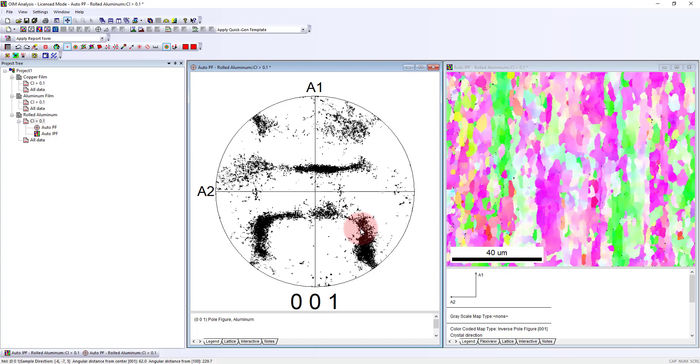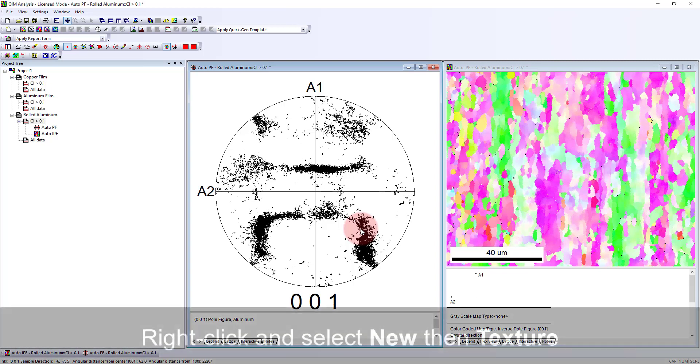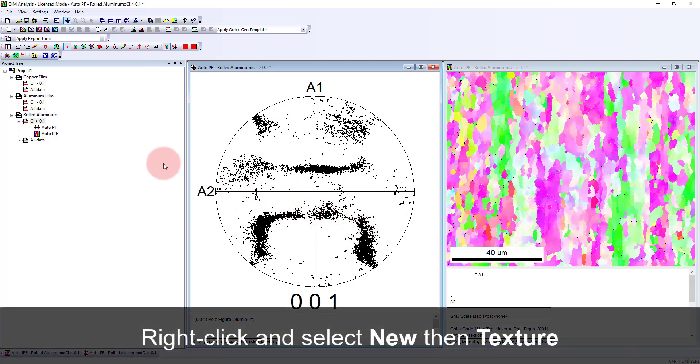When we look at a discrete pole figure like shown here, we never know if one point represents a single point or if one point has a hundred different measurements on top of it. What we like to do is do some analysis to see how strong this preferred orientation or this texture is.